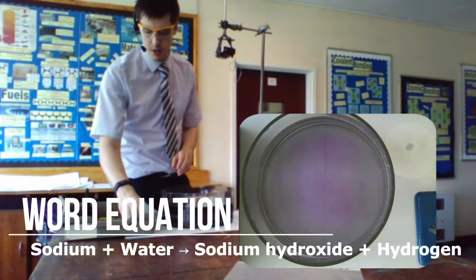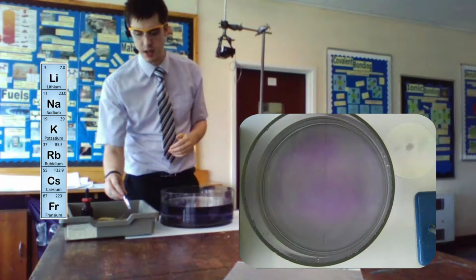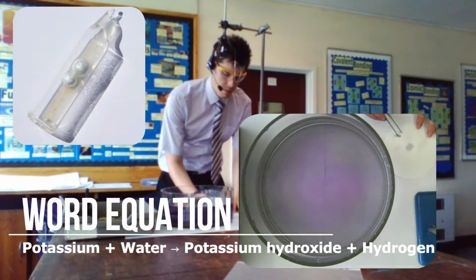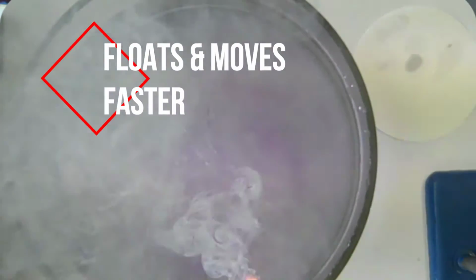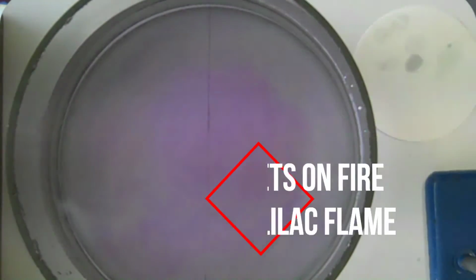So the third one I'm going to show you, you should have seen the prediction that as we go down the group, it's increasing reactivity. Let's prove that with potassium. So again, I'm going to remove the oil, and then I'm going to pop it in. Now, the difference here, it's moving around faster, it's giving off a hell of a lot of smoke, and it's set on fire with that purple, that lilac flame.